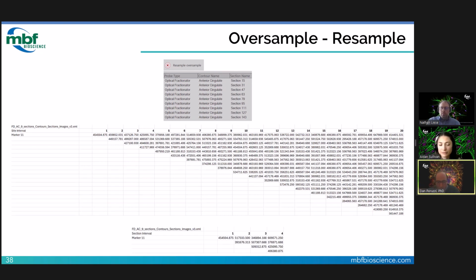And if we look at the bottom, that is done for sections instead of sites. So for number 1, that's an estimate with all the sections. If we used every other section and extrapolated each one of those out twice as much, now we're getting 5.1 times 10 to the 5th and 3.9 times 10 to the 5th. Instead of reading these off the chart, let's graph them. Yeah, I think now that you explain that in more detail, I can organize, and I know how the charts are organized here. I can figure out how to create a graph that was similar to your example.